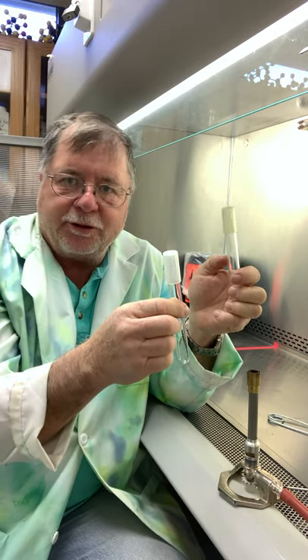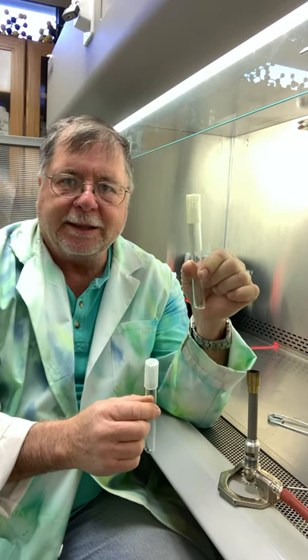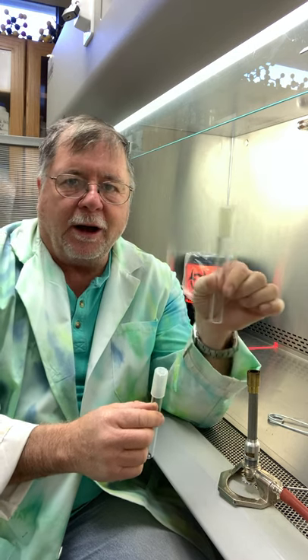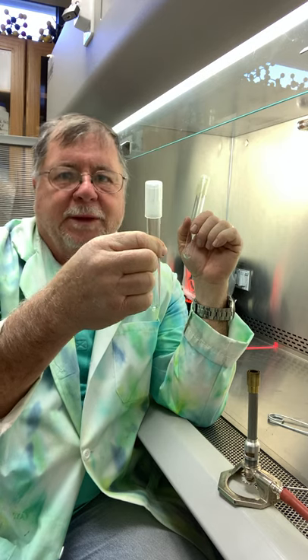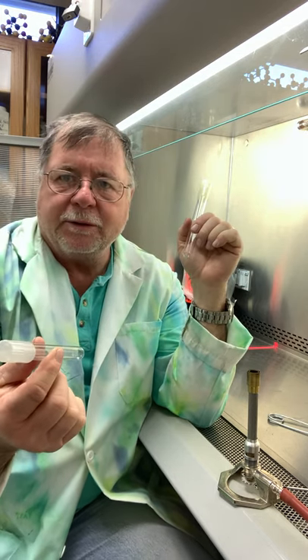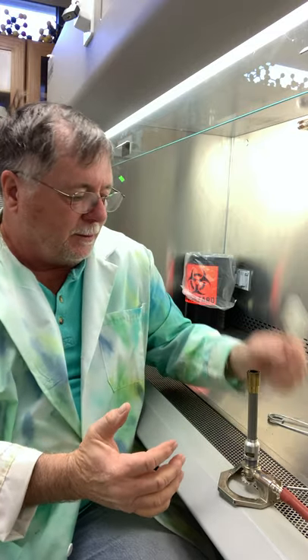We'll take the one that was just newly inoculated, and it goes in the proper temperature incubator. The one that it came from is our stock, and it's very important. It might have taken a long time to isolate this one. So we're going to put that in the refrigerator or other conditions that are warranted, but usually a refrigerator. So the stock goes in the refrigerator, and the sample that you just inoculated, which means you just introduced the bacteria into it, goes into the relevant temperature, and then it incubates usually 24 hours, 48 hours max, and then we're done, okay? And then we're good to go with those tubes.